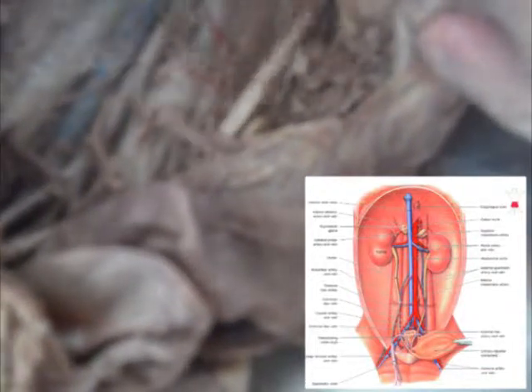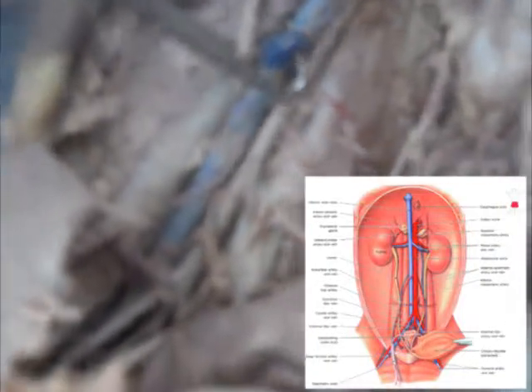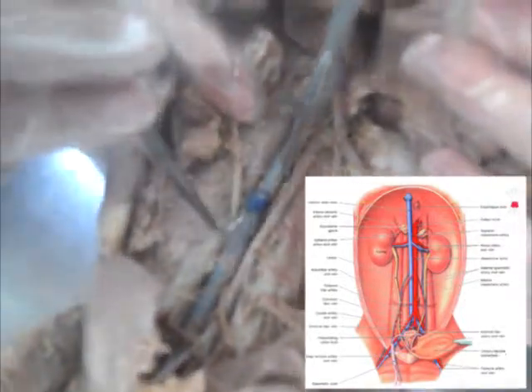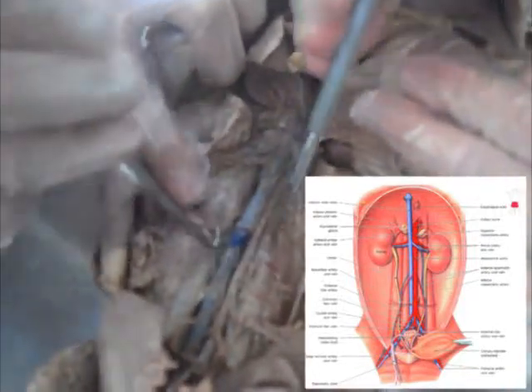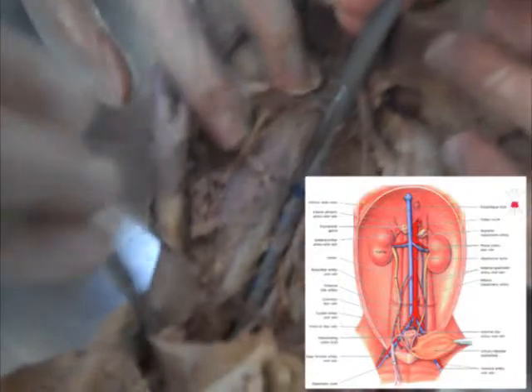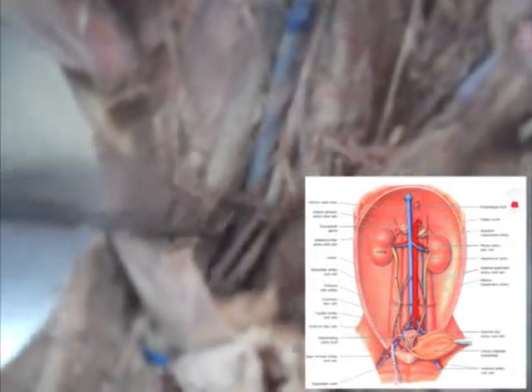Ureter. Yeah, ureter. And as we go further down past the vena cava, right here are the inferior mesenteric arteries. And as you can see, there are red parts and blue parts around here. These are the external iliac arteries. And as we go down further, it splits up into several different parts, which are called the caudal arteries and veins, which are right here.